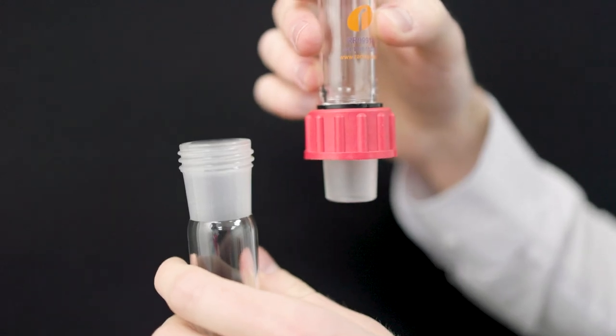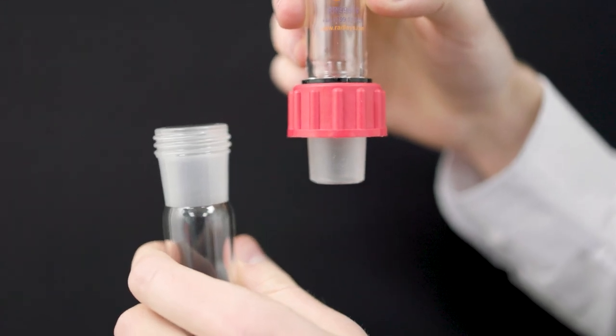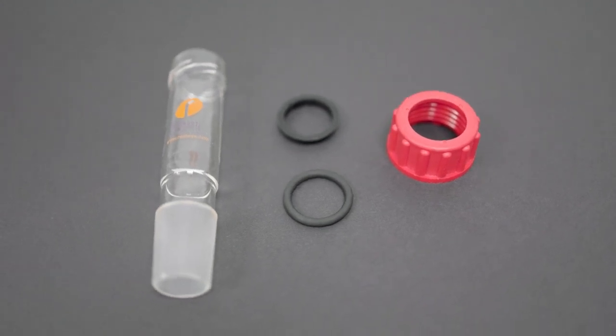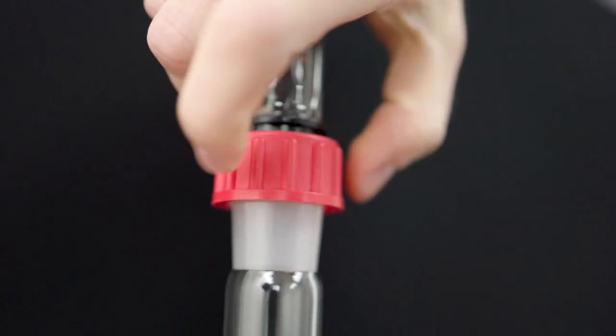They're based on a standard ground glass joint that includes a screw thread on the socket and a screw cap on the cone, supported on a glass ridge. A complete connector consists of an externally threaded borosilicate glass tube, a screw compression cap, and a Viton i-ring. When the screw cap is tightened, the i-ring is compressed, creating a vacuum tight seal.